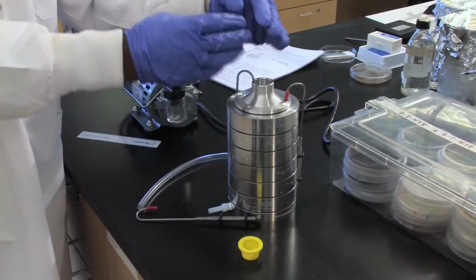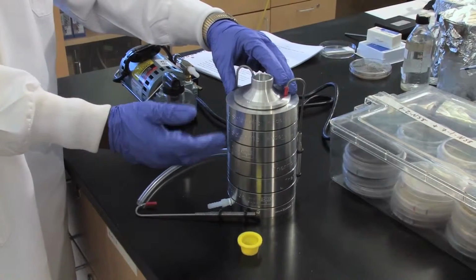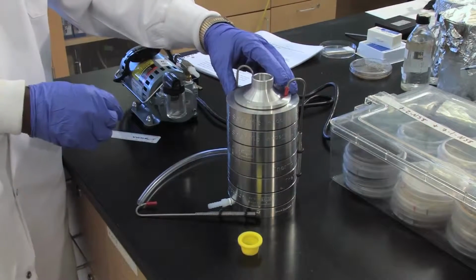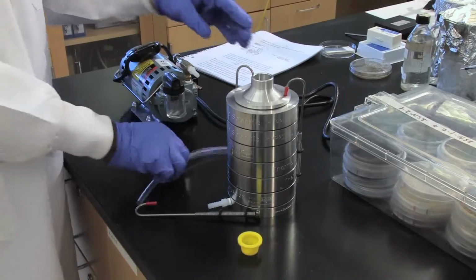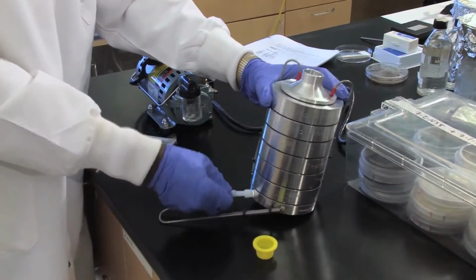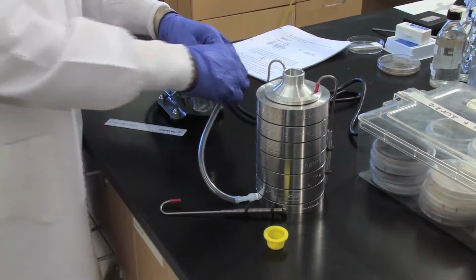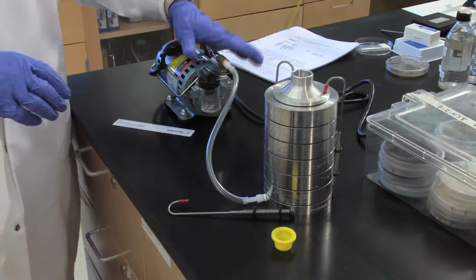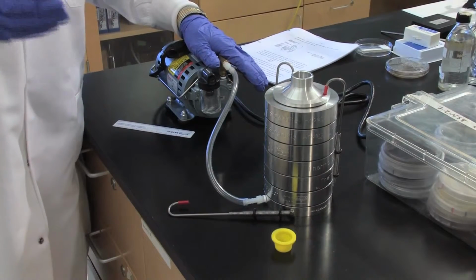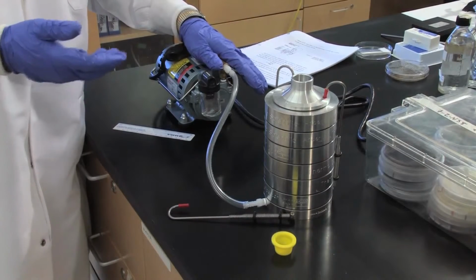So the air goes through this system of different perforated filters. And then this is connected to a vacuum. And this vacuum is supposed to be operating, drawing about 28 liter of air per minute.